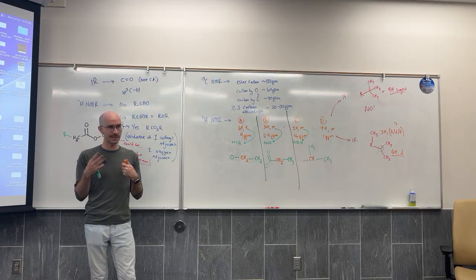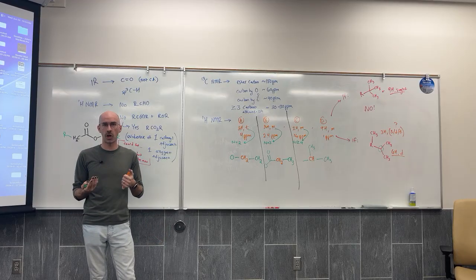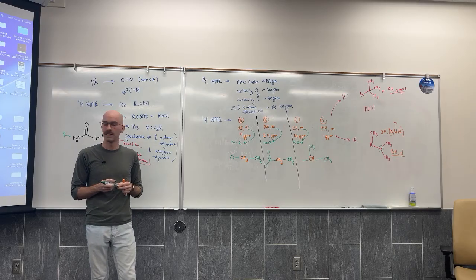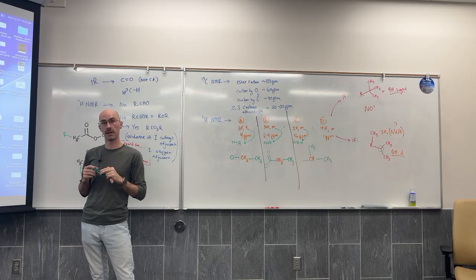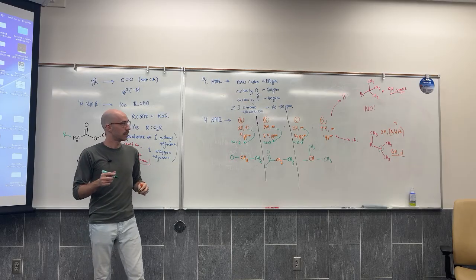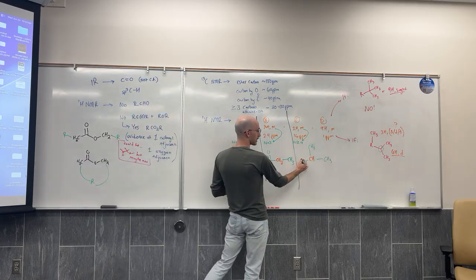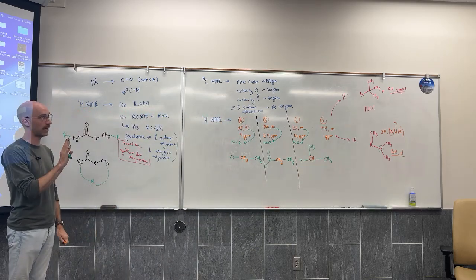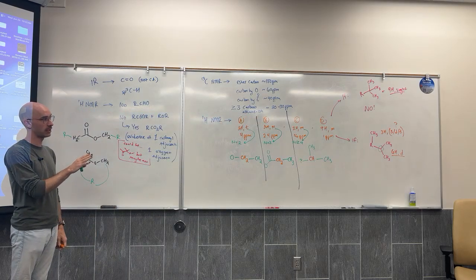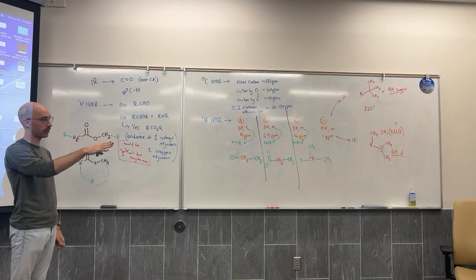So it's probably connected in every direction to just carbon groups. Whatever this last group is, to be honest, the splitting patterns aren't making sense, actually. But it's got to be just a carbon chain. So I'm going to leave it as a question mark for now, but I think we have a lot of information that we can use to start plugging this in.